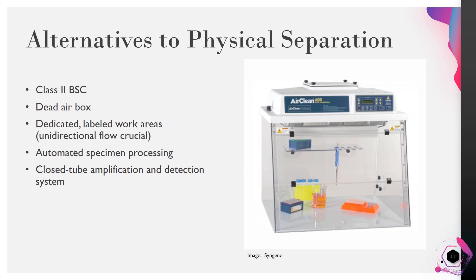Many labs do not have the space or budget for three or even two separate work areas for molecular testing. Alternatives to physical separation include using class 2 biosafety cabinets or a dead air box — called that because it lacks the ventilation system of a biosafety cabinet. If testing takes place in one physical space, it is crucial to have dedicated, labeled work areas. Automated specimen processing and closed tube amplification detection systems can also help in small spaces, but these are often costly and cost-prohibitive for smaller labs.